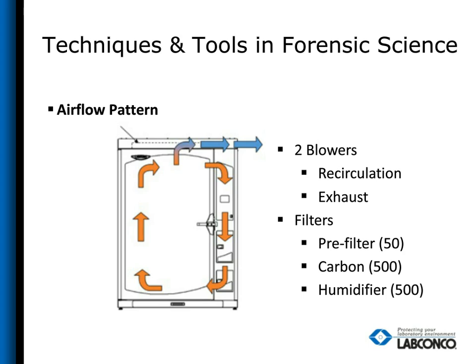It's still retaining the heat. The tin could have extra glue in it. It's going to start the volatilization process all over after the fuming has, or the exhaust has, stopped. All the exhaust is doing is pulling off those CA fumes from the tin and putting them through the filter. But once the automated exhaust stops, those fumes start building back up in the chamber, and you see the evidence being overglued to the point where it can damage it.